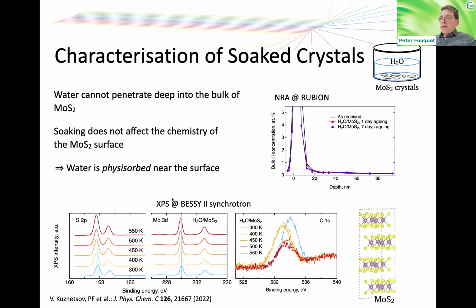And also when you look at XPS, and then heat up the sample, look at the sulfur line, at the molybdenum lines, and the oxygen line here for comparison, there's not much happening basically. So no chemistry happening. The water is only physisorbed on the surface.